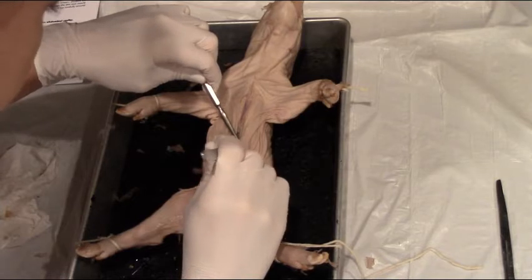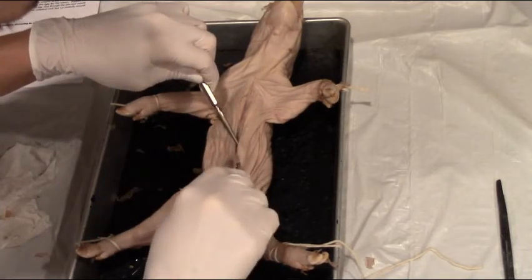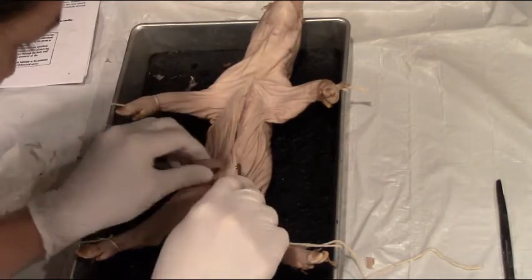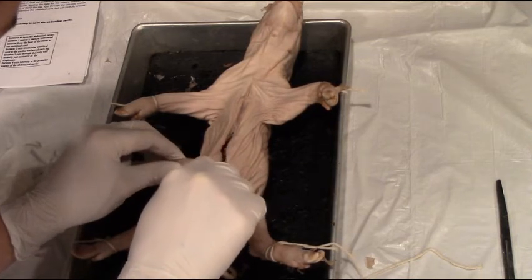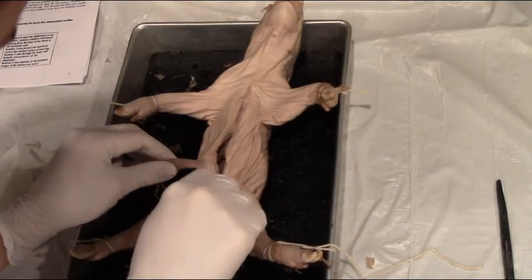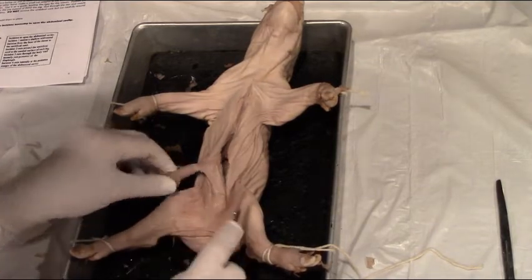Now I'm going to do cut number two on your diagram — cutting around the umbilical cord. You may want to have one partner holding the probe so that your partner knows how deep to cut. Again, we don't want to cut into any organs; we just want to open up that area.